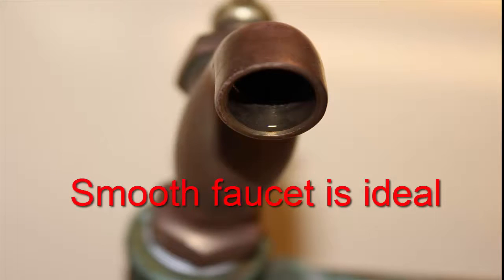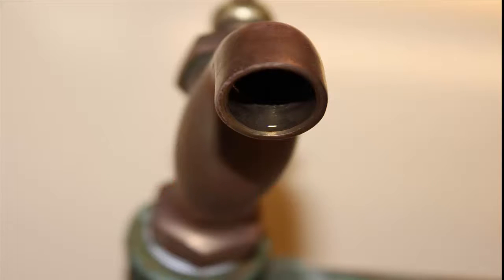You'll also want to locate a tap or hose bib that has no inside threads or grooves and, if possible, no outside threads. These areas are common habitats for bacteria.